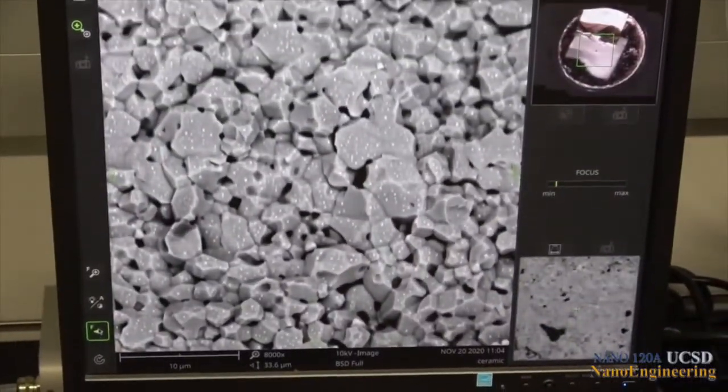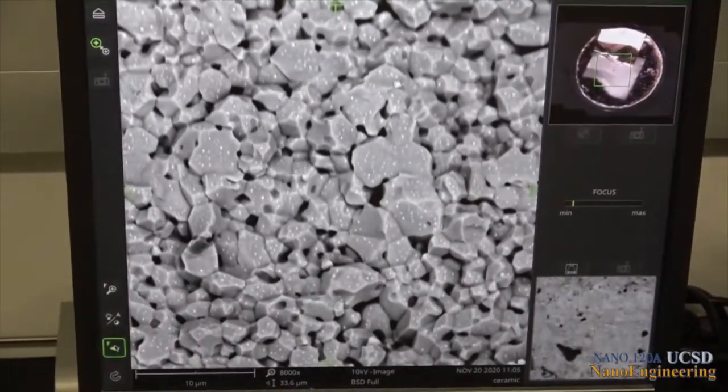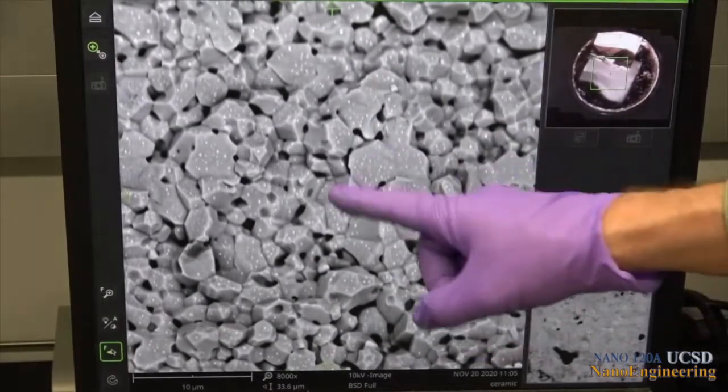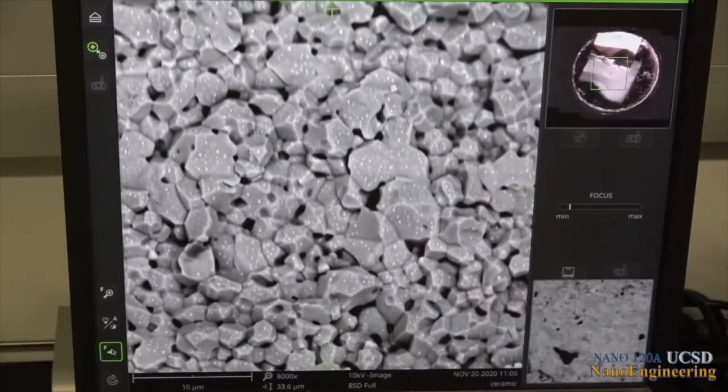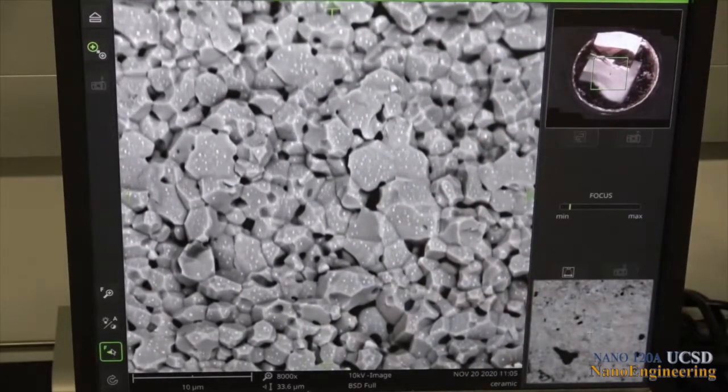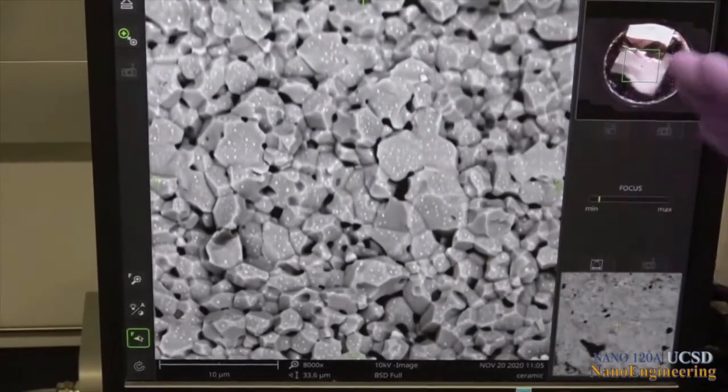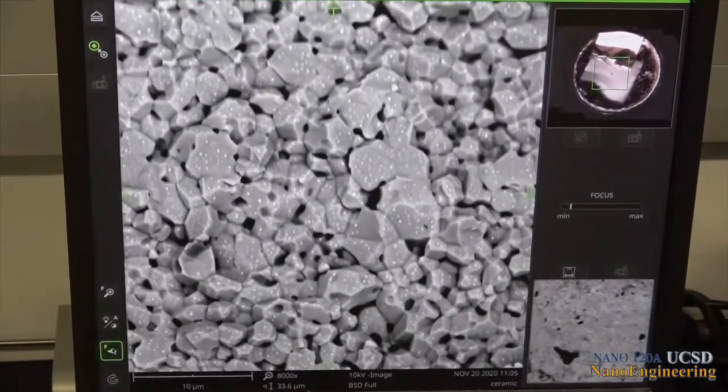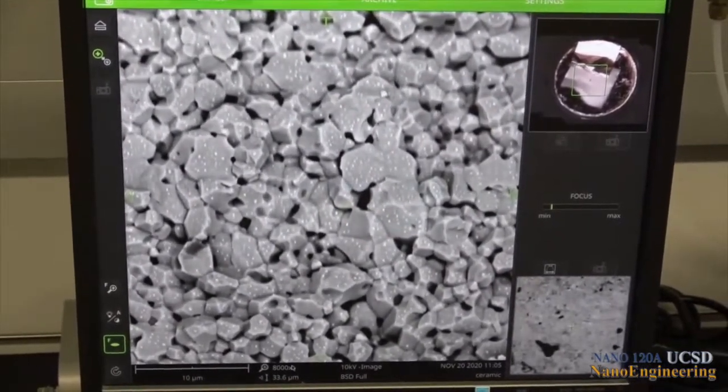This sample was prepared by pressureless sintering a powder compact of titanium oxide powder to approximately 90% density. Note the grain structures and porosity present. The capability of the backscatter detector to exhibit atomic number contrast can be shown by the brightness differences observed between the titanium rich grains of atomic number 22 and the brighter small specks or flakes of gold of atomic number 79 that was sputtered on the fractured surface.